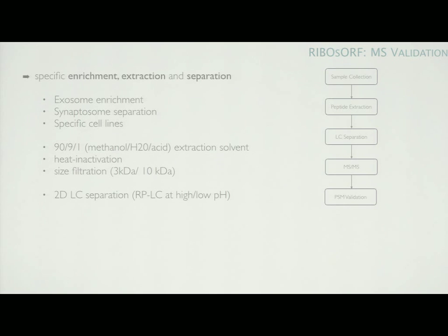And there are several options at different levels. I mean, at sample collection, you can optimize, at peptide extraction level, at separation level, even at mass spectrometry and validation, you can optimize.